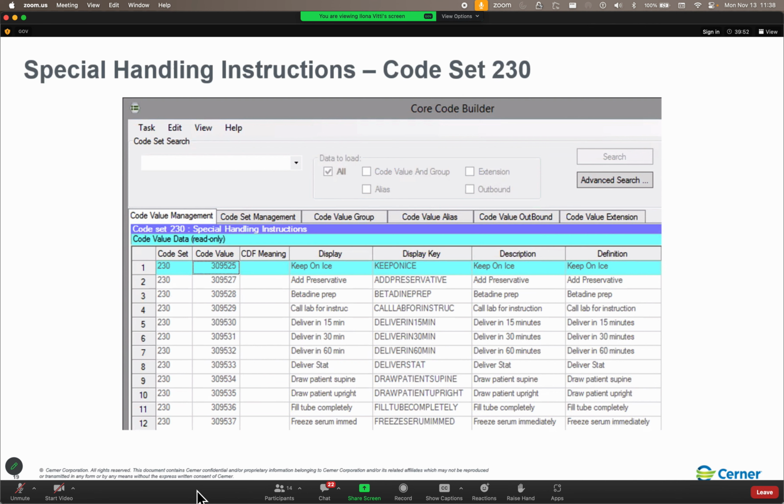So that's the code cache manager, I believe. So instead, we either wait the 10 minutes for the code set to refresh, or we log into the backend and run this command, CRM test, and 6024 is the number for the command for refreshing a particular code set.